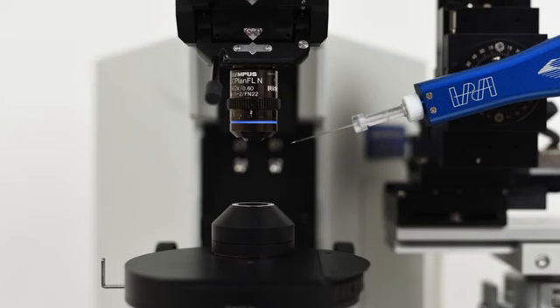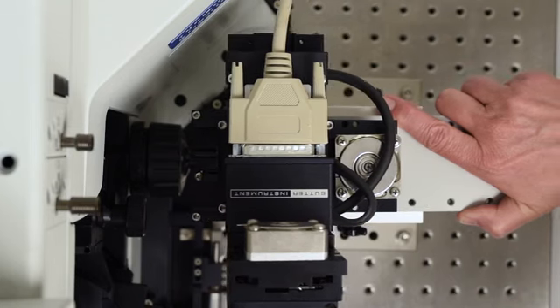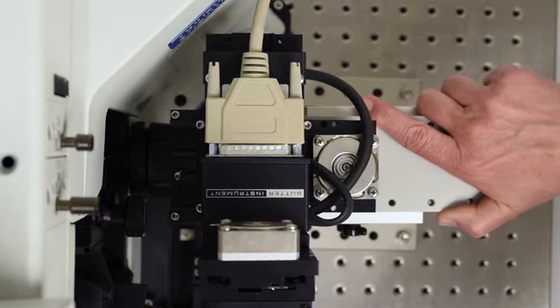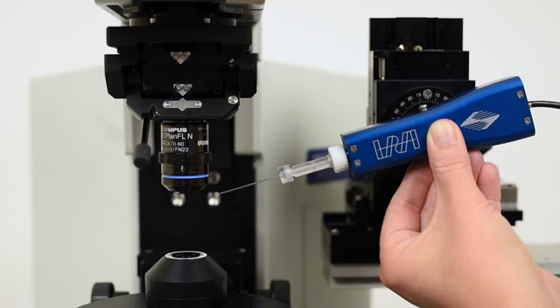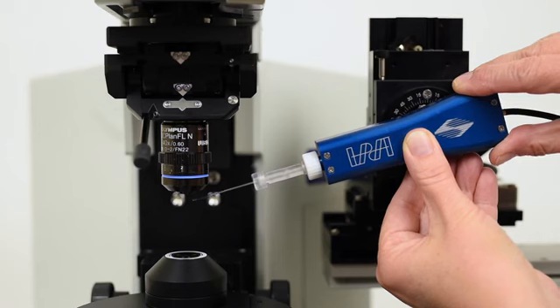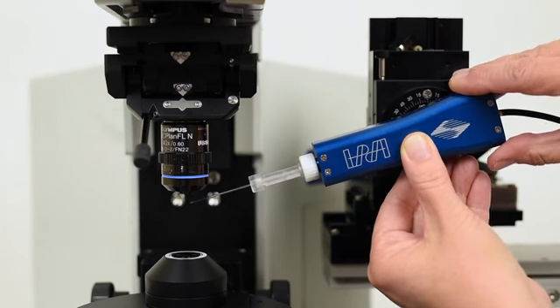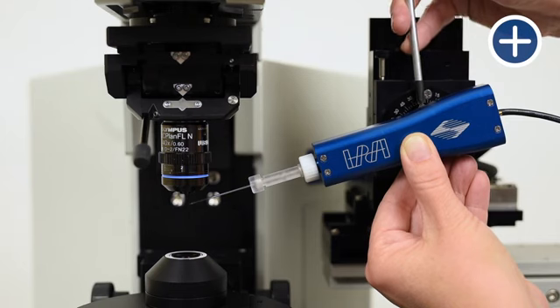As you can see, the manipulator is now short of reaching the objective. With the Sutter MT75 tower, you can simply slide the gantry toward the objective to set the correct working distance. A second option would be to clamp the head stage further down on its dovetail. While this will give you better reach, it is less desirable and will cause more instability in your setup.